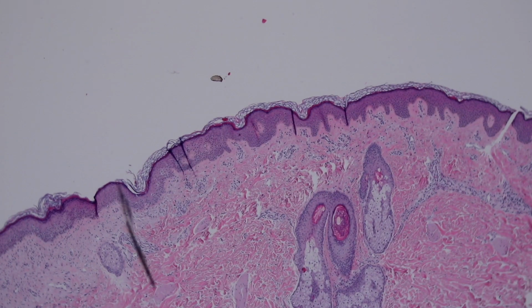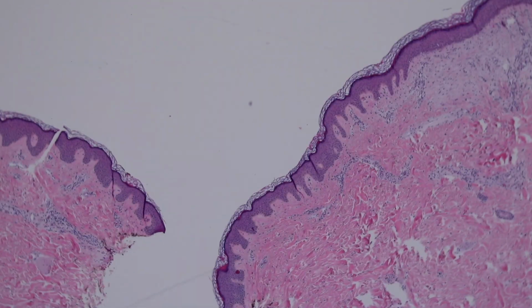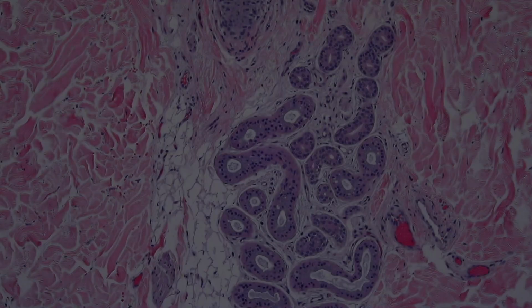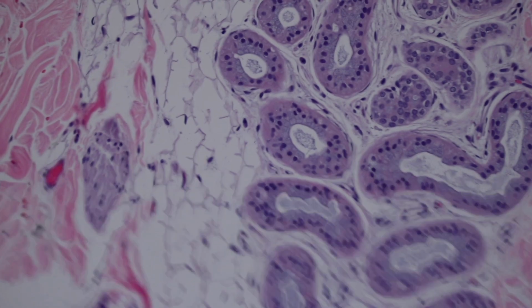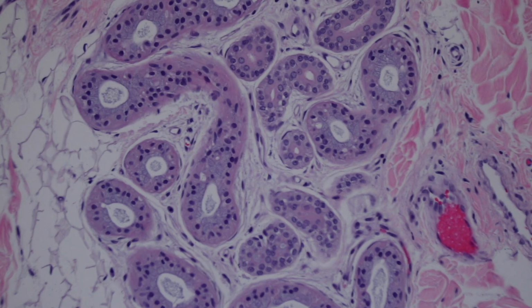You don't always see every structure that you're looking for on every piece of tissue. All right, well, we'll have to see one in another piece of tissue. So here, these eccrine coils, they have a unique kind of lining. They're lined by a double layer of cuboidal epithelium. So cuboidal cells have round nuclei and are slightly square or cuboidal in shape.